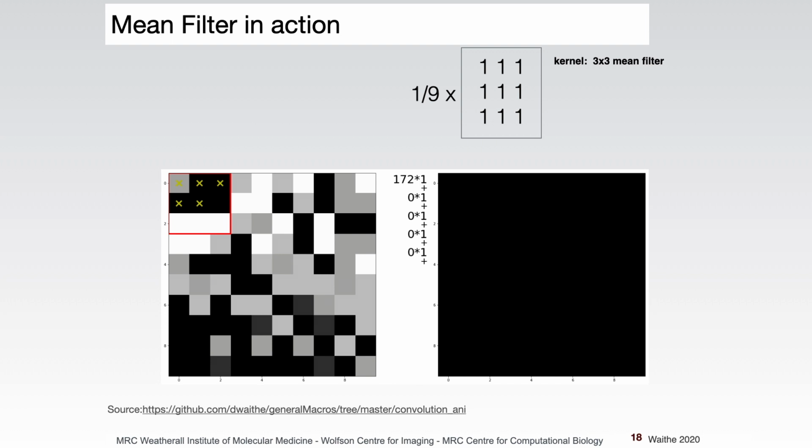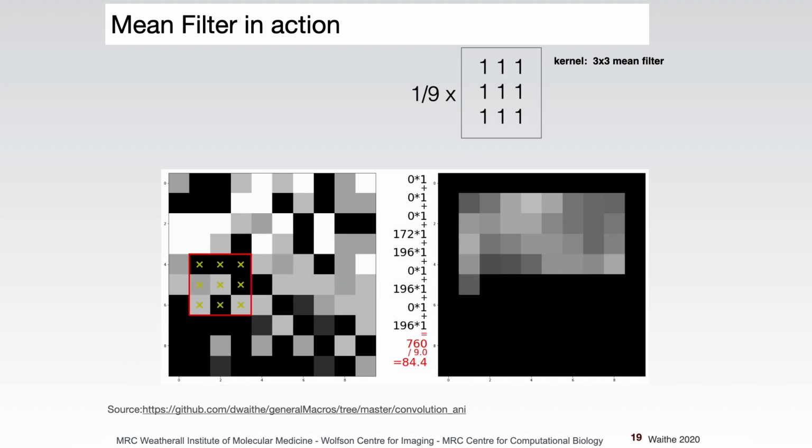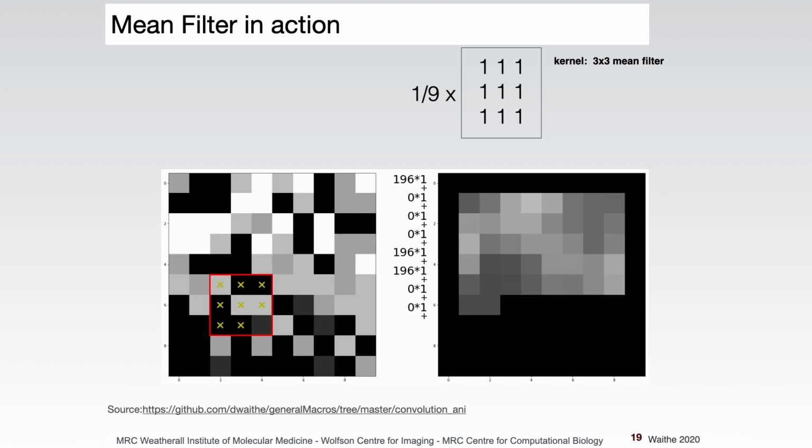So this is actually what's happening with the convolution. Imagine we're starting in the top-hand corner, and now we're working through the kernel, and we're just multiplying, and you can see me doing the multiplication there and summing it up. Then we get one pixel output here. So I'm just repeating the first location. Then I'm going to move to the next slide, which will show this process applied to the whole image. There we go. Now this is actually what you would do in a practical setting. You would apply it to the whole image, and you can see it's running through very quickly now, what I was showing you in slow motion. So you can see the output is a blurry version of the input. It's a smooth version.